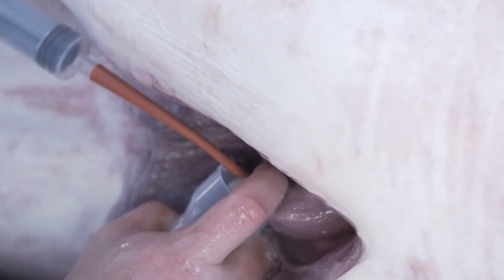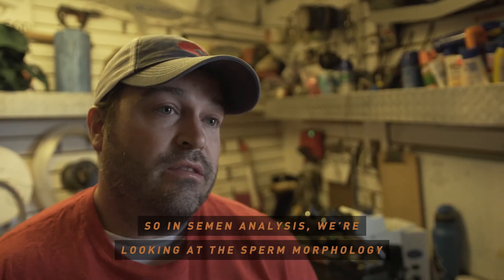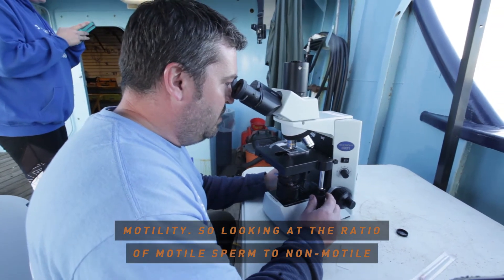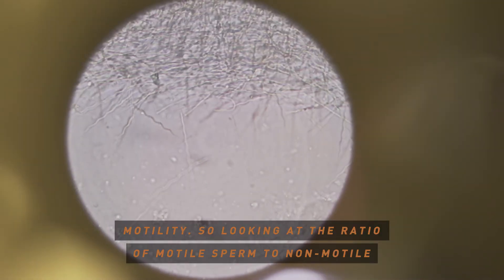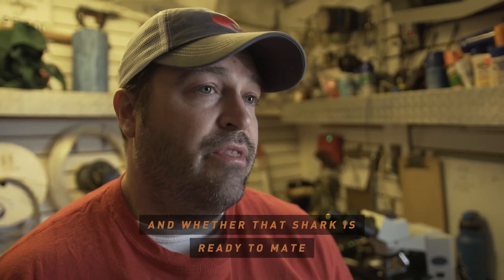In semen analysis, we're looking at the sperm morphology and motility — so looking at the ratios of motile sperm to non-motile, which might indicate the level of maturity of those sperm cells.